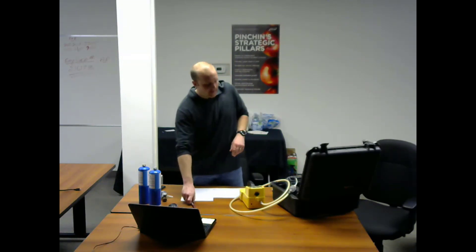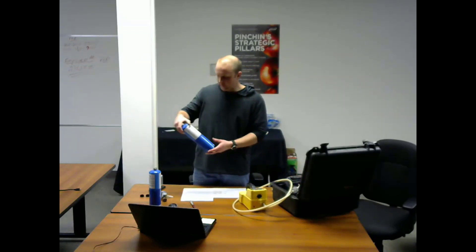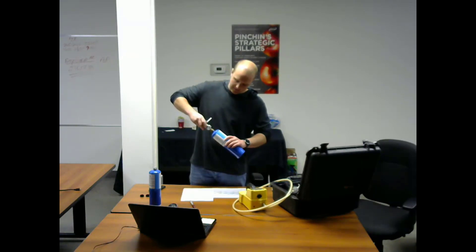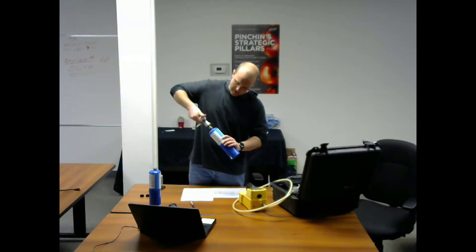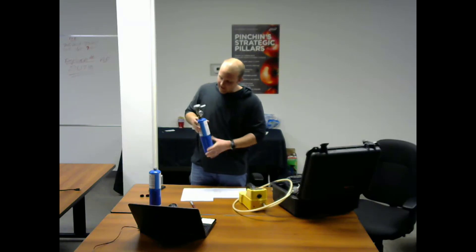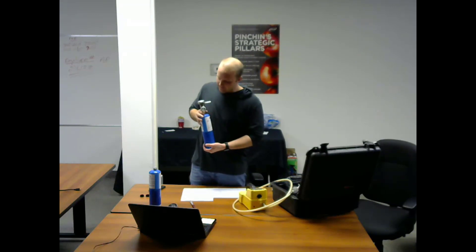Next, start with your parts per million gas and connect the valve to the canister — we're going to use the isobutylene first. Here's my isobutylene gas. I'm going to connect my valve to the canister. You can hear that little click there. As I was screwing this in, the valve becomes pressurized and you can actually see how much gas you have in your canister.